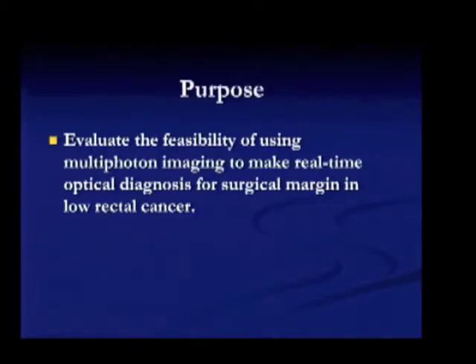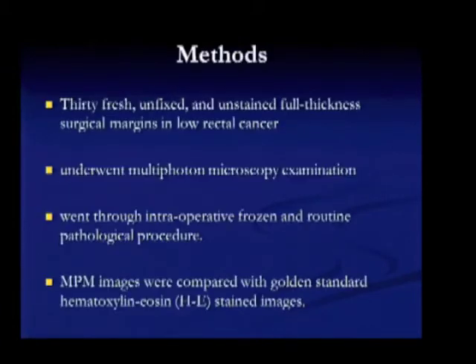So the purpose of my study is to evaluate the feasibility of using multiphoton imaging to make real-time optical diagnosis for surgical margin in lower rectal cancer. 30 fresh, unfixed, and unstained full-thickness surgical margins in lower rectal cancer underwent a multiphoton microscope examination and then went through frozen and HE staining procedure.